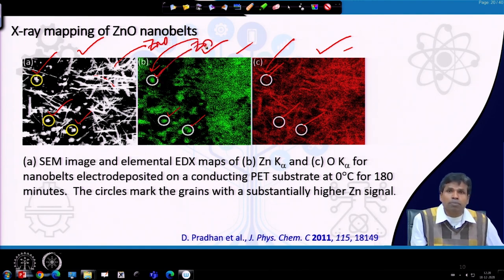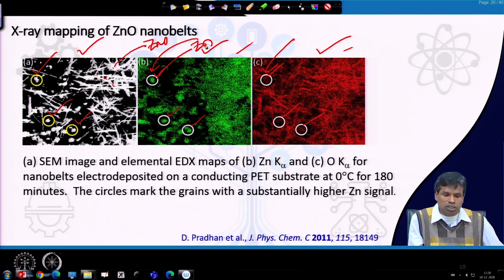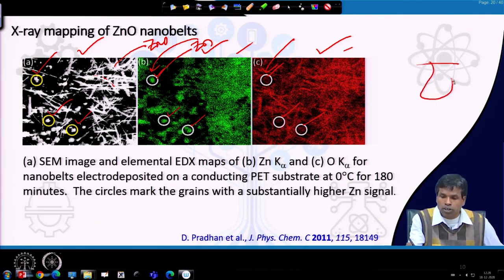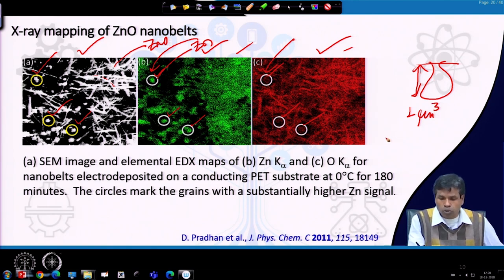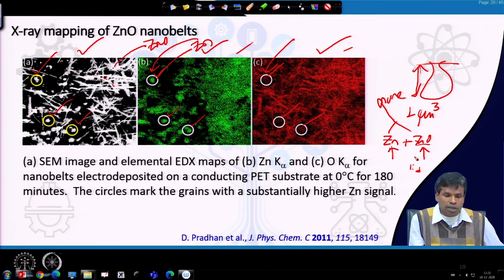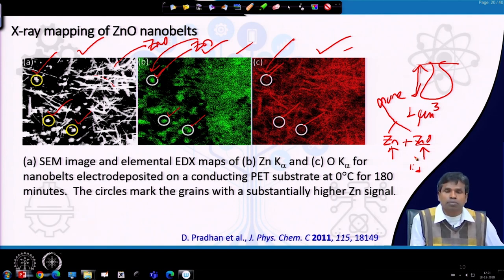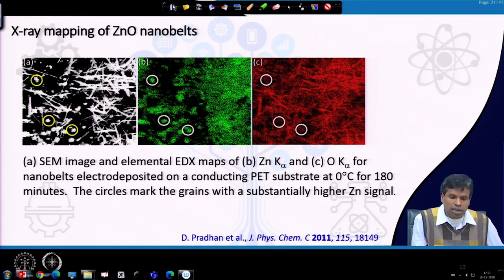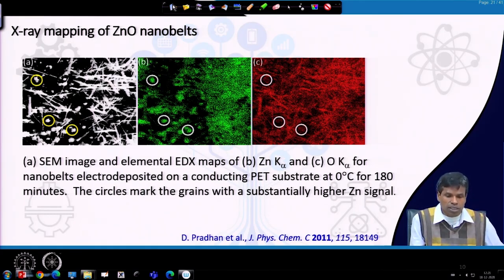If we do elemental composition of a particular area, the interaction volume is approximately 1 micrometer cube, so the zinc composition measured will include zinc from both zinc metal and zinc oxide. Therefore the stoichiometry will not be maintained at 1:1 in this kind of sample. To know the distribution or presence of zinc metal, mapping is most suitable — this example demonstrates how mapping helps confirm the presence of zinc metal within the zinc oxide sample.